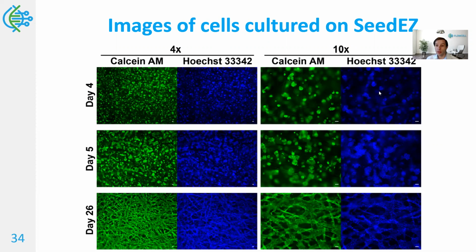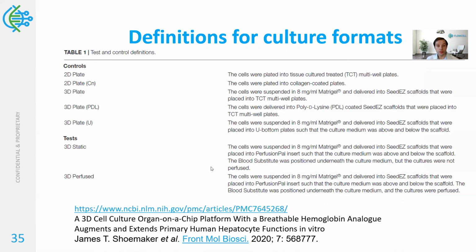You can see that the nuclei are co-located and how the fibers reveal themselves after several weeks.